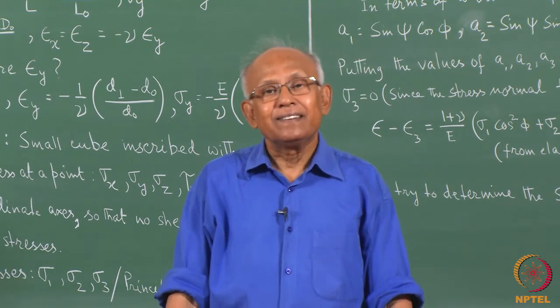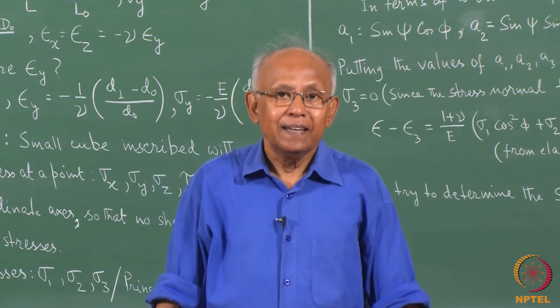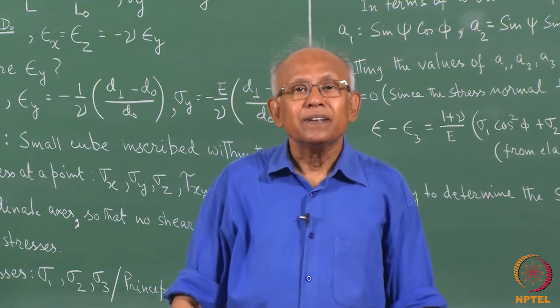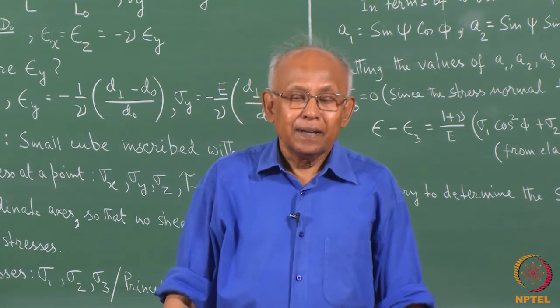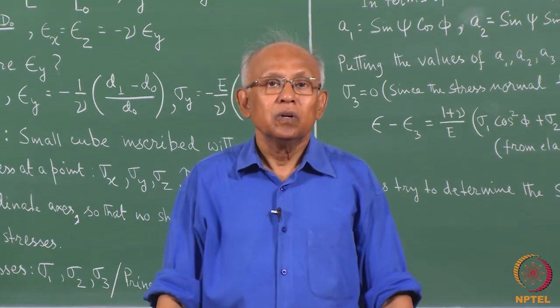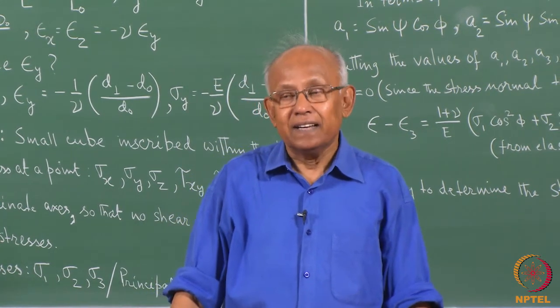Now, this change in the value of the interplanar distance will give us a measure of the stress that has been put on the material. Normally in the X-ray method, we do not measure stress directly.